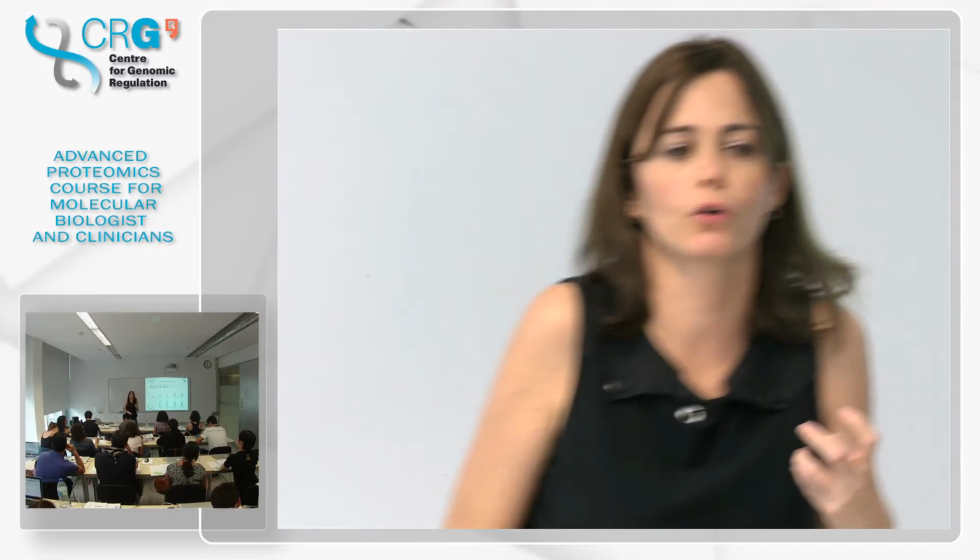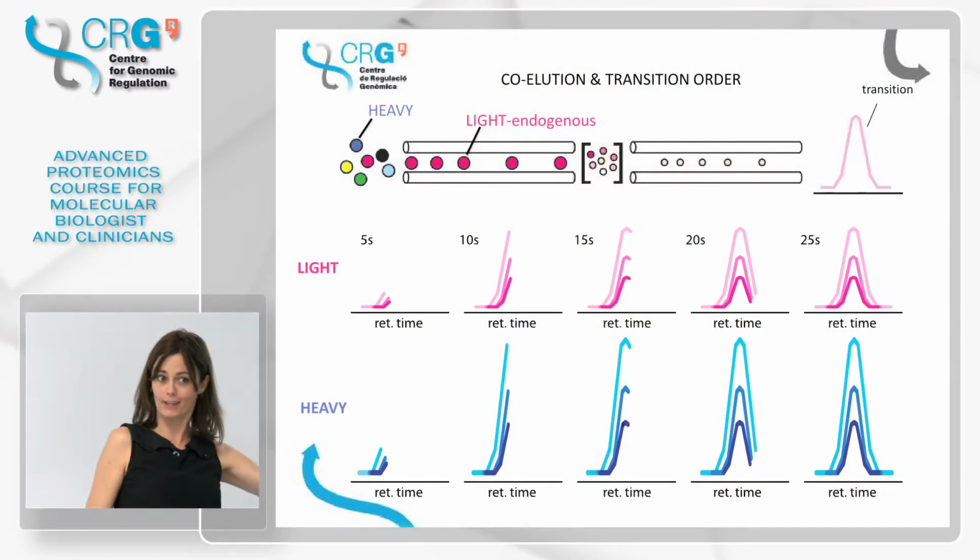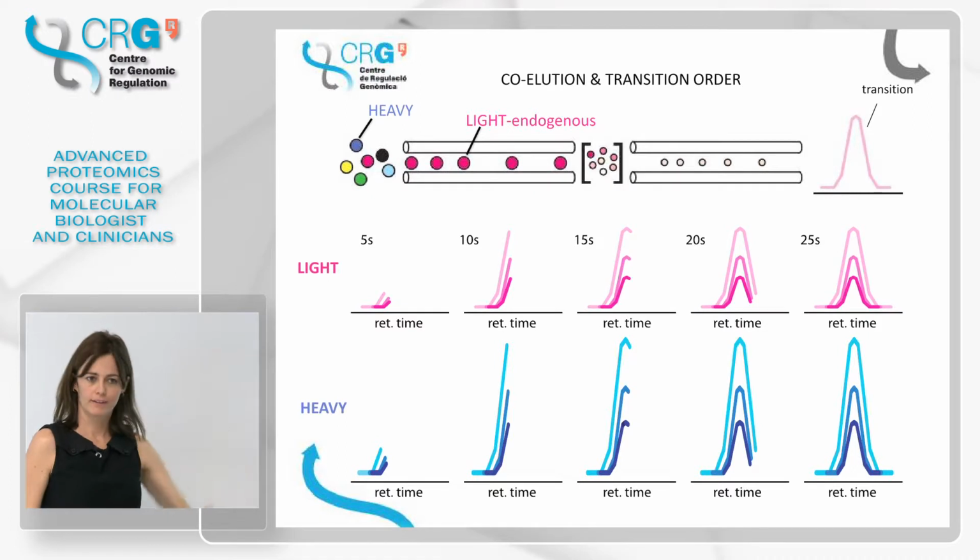But would you also need to change the voltage settings on your quadrupole? Yes, but you actually don't go and change anything. We just add to your list these other masses that are different. So your list of masses to monitor is now double.